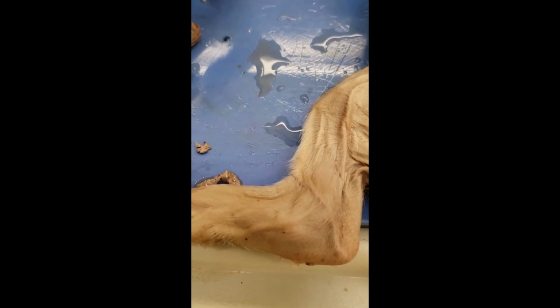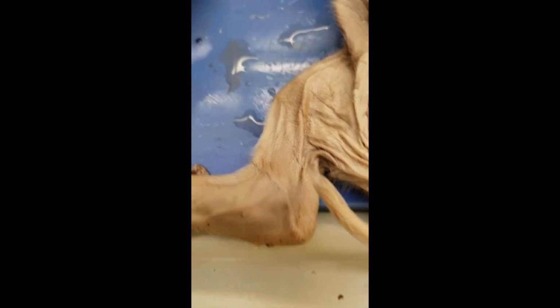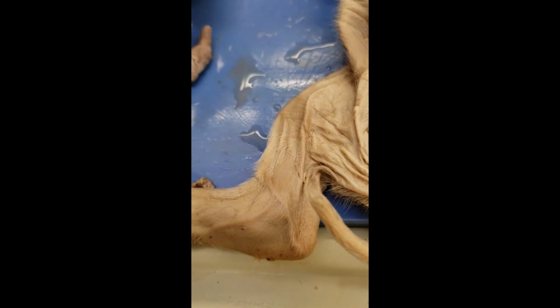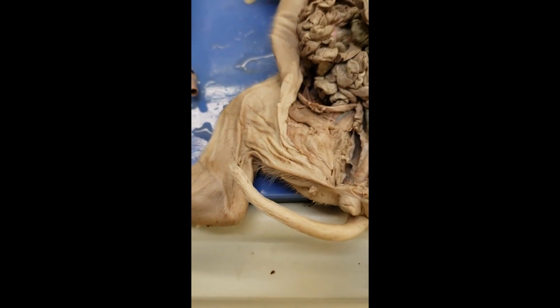So in the beginning of the fetal pig dissection, we talked about the trachea, right? And I told you I'd try and see if I could cut this thing open. It is extremely difficult to do one-handed. So I'm just gonna hold this in. I'm gonna set the phone down for a second. Cut it open, I'll bring you back. So just stay tuned, hold on. Prop you open. Yay, phone!